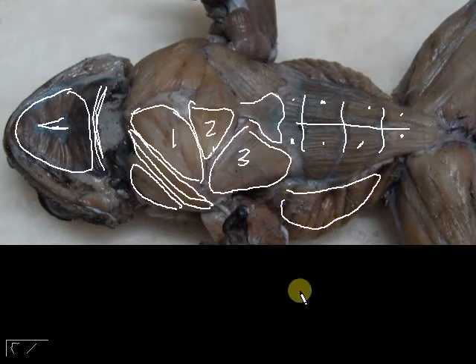There. So just to recap, the more superior part, the deltoid right here, and then the coracoradialis, and then the anterior pectoralis, the middle pectoralis, and then the posterior pectoralis, and then the rectus abdominis, and then the linea alba, the white line that divides these into the left and the right. And then of course you also have inscriptiones tendinae.